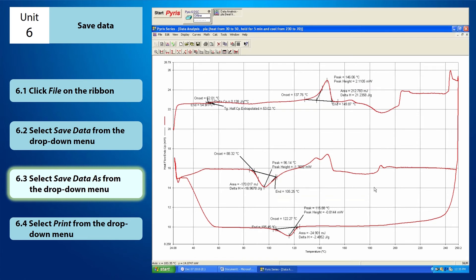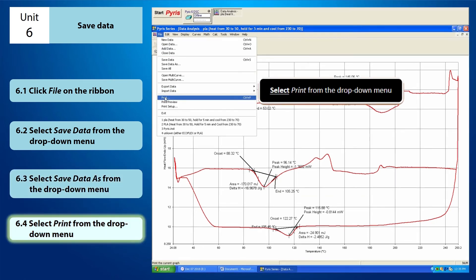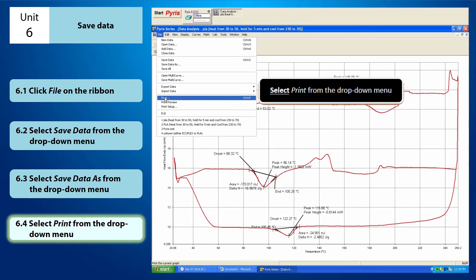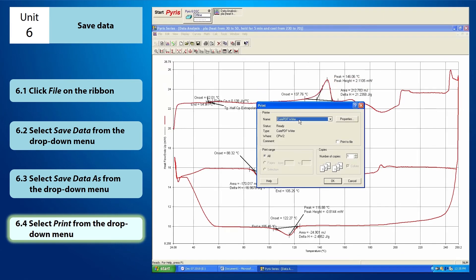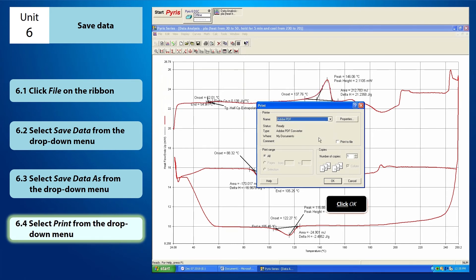If you want to save the data in PDF format, select print from the drop-down menu of file. In this print window, select Adobe PDF from the name field. After that, you click OK.